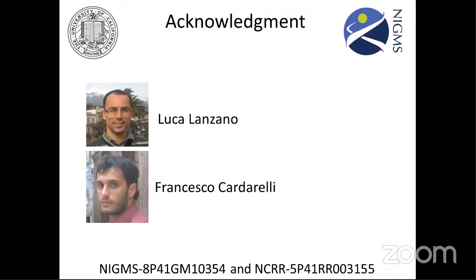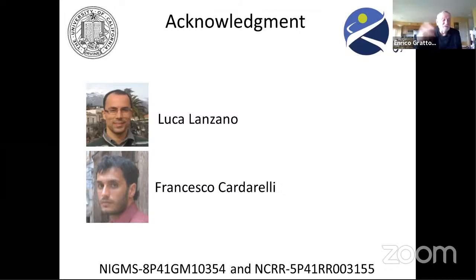They worked together, and I think this combination with particle tracking is very nice. On Wednesday, Alex Valmishana will talk about that, and how the combination of particle tracking with the fluctuations gives the chance to do all these things. Yeah, and the fact that you can follow all the points of the orbit, and now today we can measure lifetime, we can measure FRAP, so we can measure many other properties along the orbit.